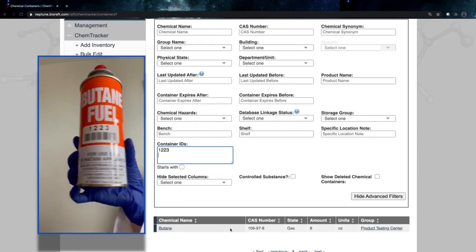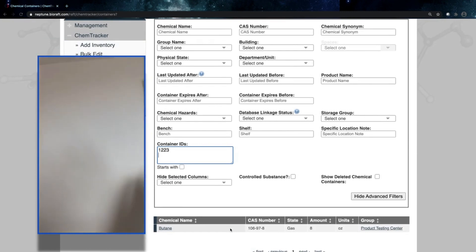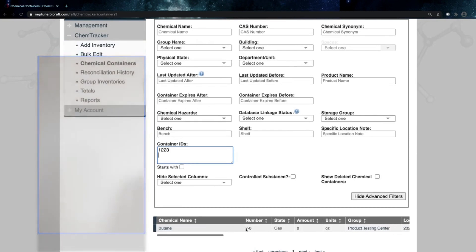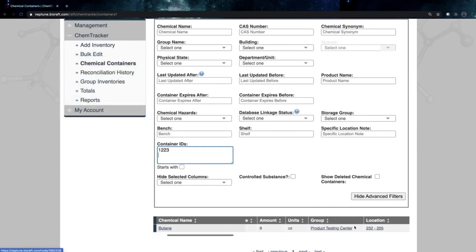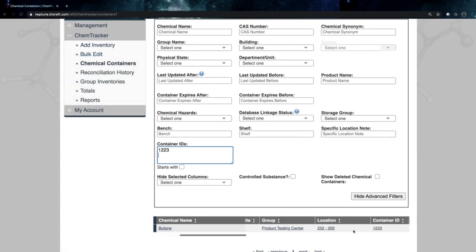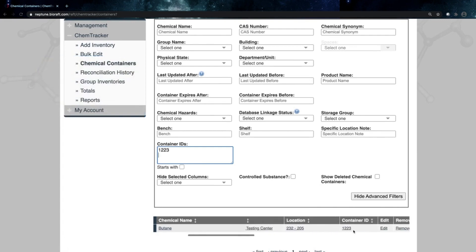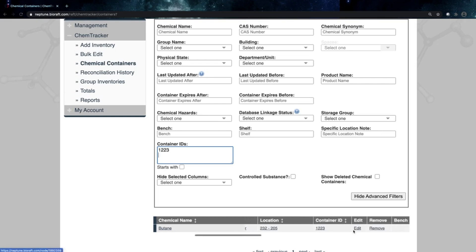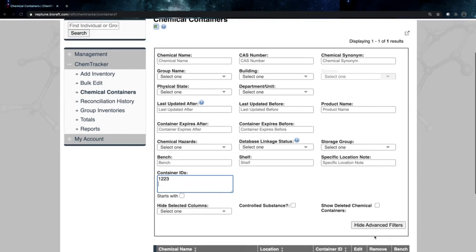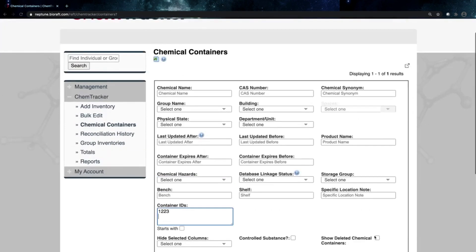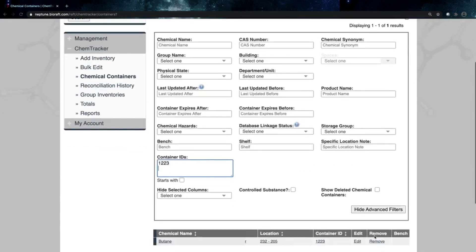So I can see that this bottle of butane, I can see who it belongs to, where it's stored. I can even access SDS and hazard information if I wanted to as well. From here I could also move or edit that container. As soon as I have that barcode or RFID tag, I have all this data accessible here.